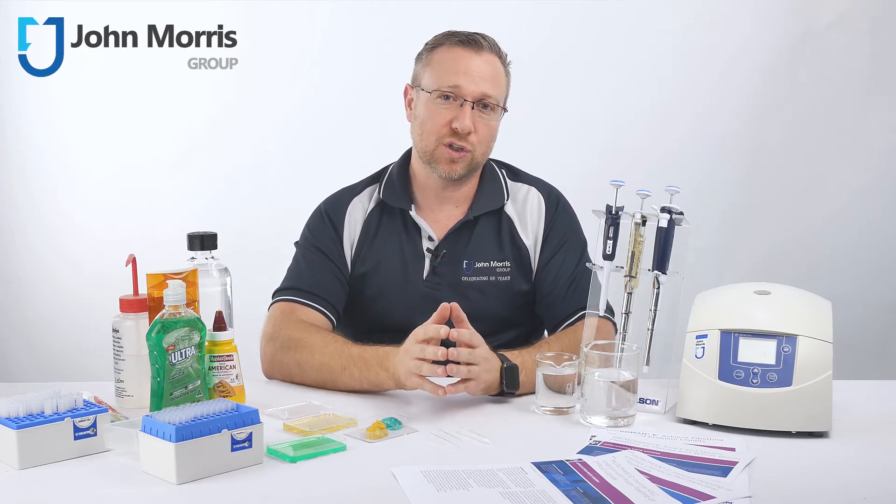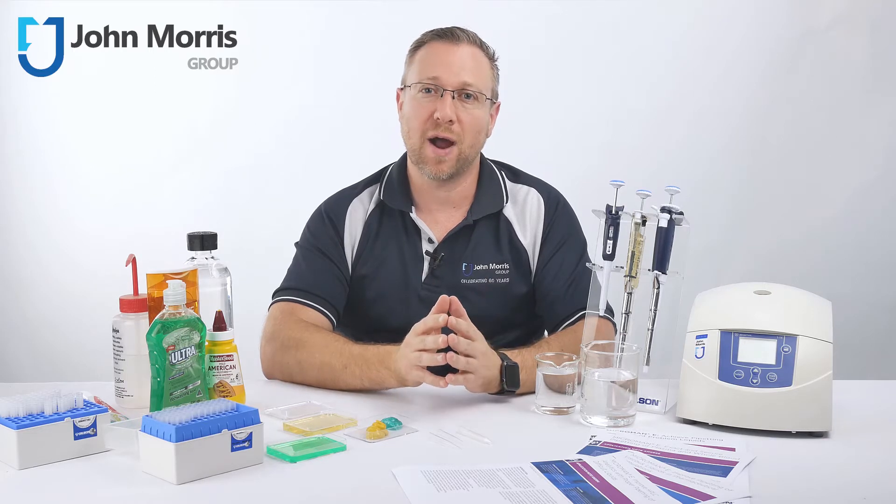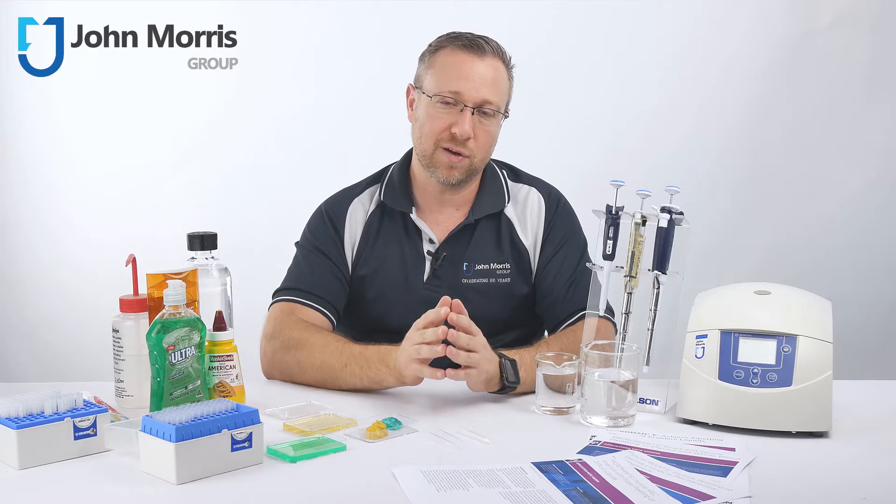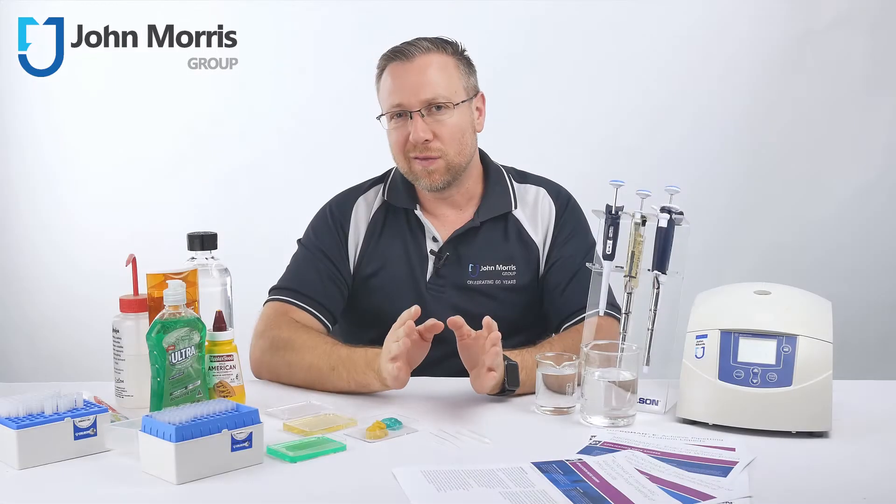In these situations, positive displacement pipettes such as the Microman are ideal. Today we're going to demonstrate this so you can feel more confident in your pipette selection. But first, a little theory.